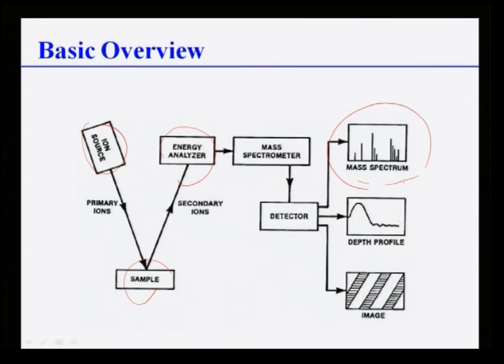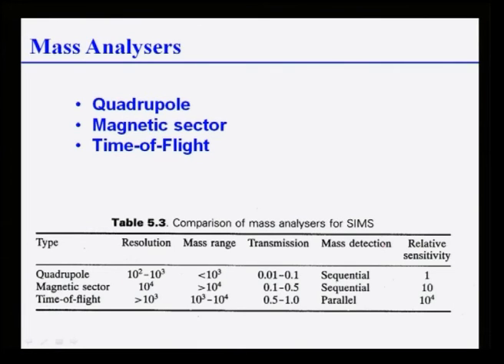You can also have a depth profile, which I am going to discuss. It is very important in material science. And you can also create a two-dimensional image. Truly speaking, you can create a three-dimensional image also in SIMS. It's such a powerful technique. That's why I wanted to show you this basic overview before. Now I'm going to show you how depth profile quantification and image formation is done. These are different mass analyzers used, and the idea is to show you how their relative behavior is.